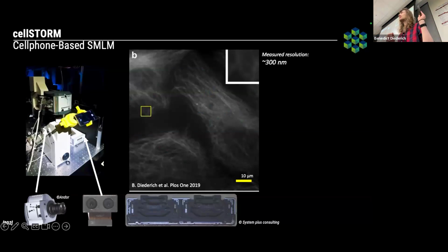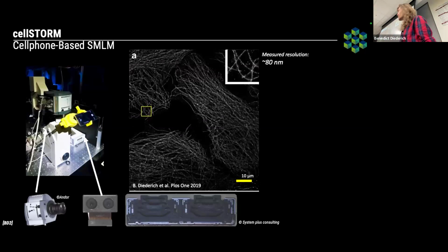It's a monochrome camera, so you capture a little bit more light because you don't have the Bayer pattern. The way cameras anticipate colors is that you have 3 color channels, and they are kind of blocking away certain amounts of light. But here we were able to capture all that light and then went from the typical fluorescent image, which you see maybe on the right-hand side, to a super resolved image.